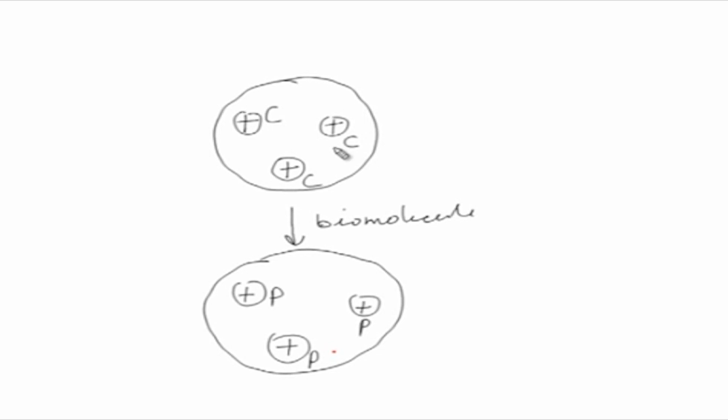So, protein is bound here, and those protein molecules which are carrying negative charge will bind in here. If I show it here, it is something like this. If this is positive charge on the resin, then negative charge will be binding, and this might be any molecule which is present in here. All right. So, once protein is bound, then you have these protein molecules. If there is a mixture of protein molecules, then they will bind with different affinities depending on the charge. If they have more negative charge, they will bind with more affinity, if less, then they will bind with less affinity. Now, what you have to do?